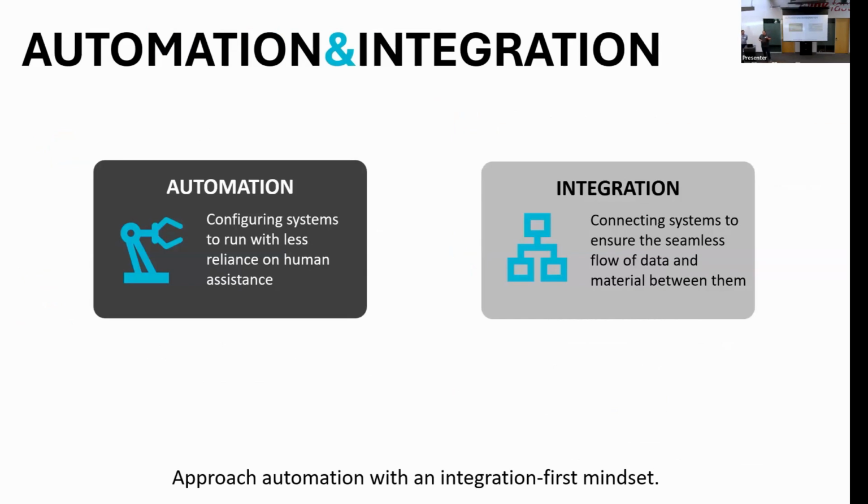And what I've always worked with people on is how you apply an integration-first automation strategy, where even if you have people in the loop moving samples, you want it to be as integrated as possible so that the data is transferred seamlessly, and that there's tracking and traceability on your samples. And with that focus, you can then scale to fully autonomous or automated systems much more easily if you focus first on the integration aspect rather than on the physical automation of a platform.